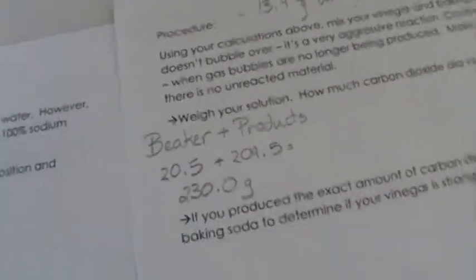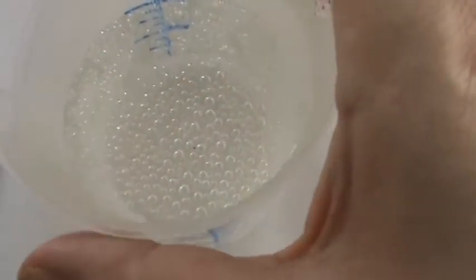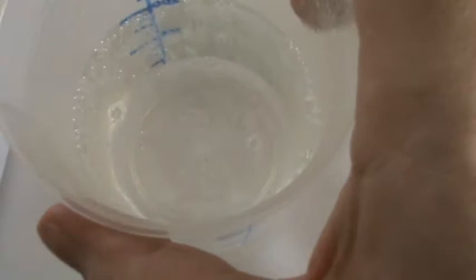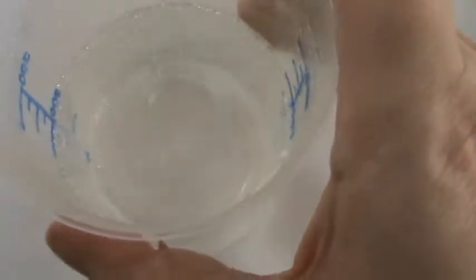All right, so now I come over here, and I don't know if you can see this. Do you see all the bubbles in there? I want to make sure that those bubbles go, because those bubbles are carbon dioxide, and in order for this to really work, I need to eliminate that contamination. And one of the ways that you can do that, I don't know if you can see what I'm doing, but I'm basically just tapping it on the table to get the bubbles to release. Okay, and I'm going to stir and agitate again.